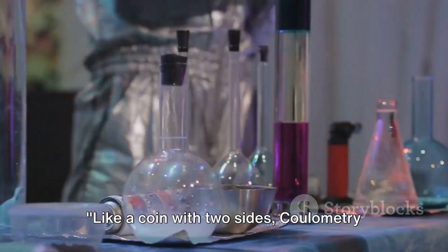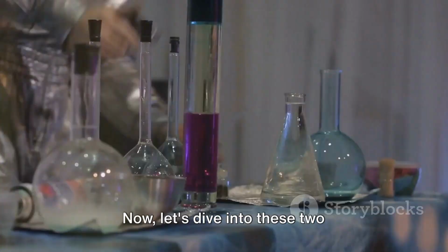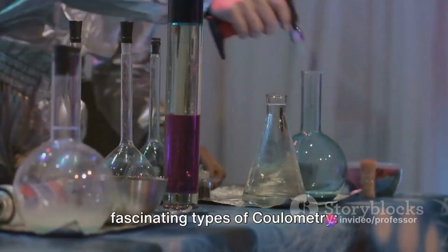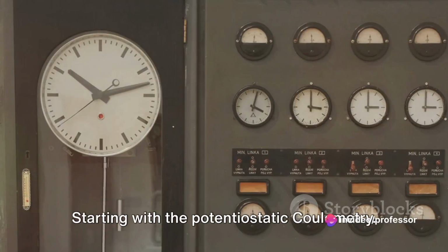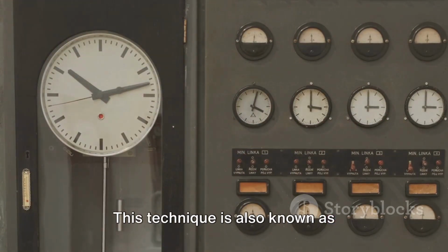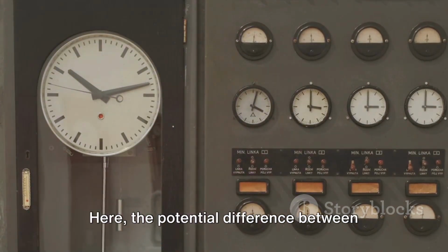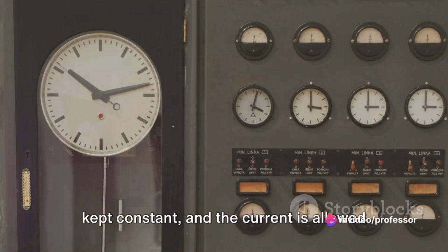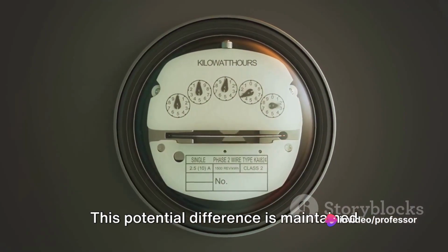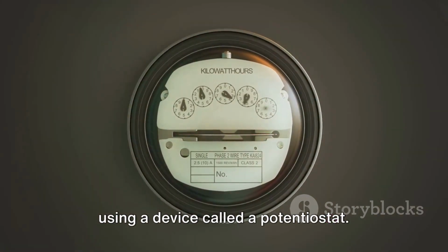Like a coin with two sides, coulometry also presents us with two major types. Now let's dive into these two fascinating types of coulometry: potentiostatic and amperostatic. Starting with the potentiostatic coulometry. This technique is also known as coulometry at controlled potential. Here, the potential difference between the working and reference electrode is kept constant, and the current is allowed to change. This potential difference is maintained using a device called a potentiostat.